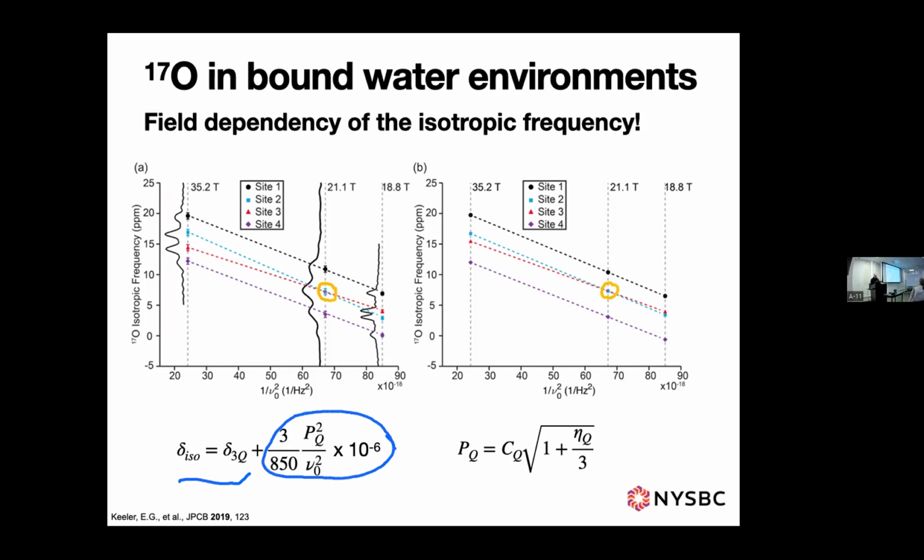So Eric, did you say why you picked 3 quantum? Yeah, so I didn't. Obviously, it's a spin 5/2 nucleus, so you can do 5 quantum. 5 quantum would get you narrower, but significantly reduce your sensitivity due to the much lower conversion rate of the 5 quantum excitation and conversion pulses.